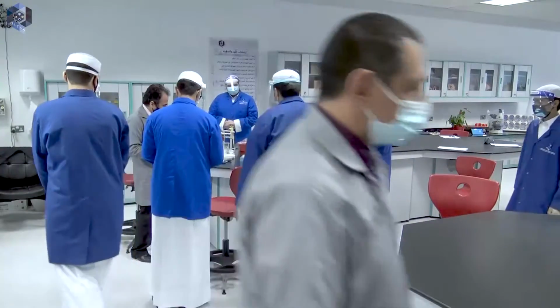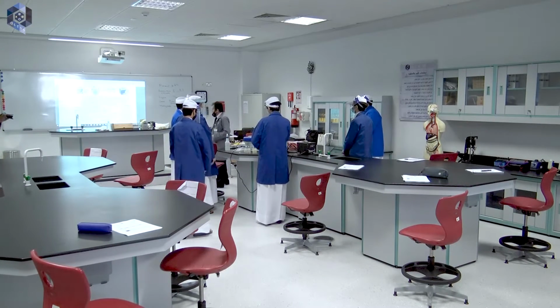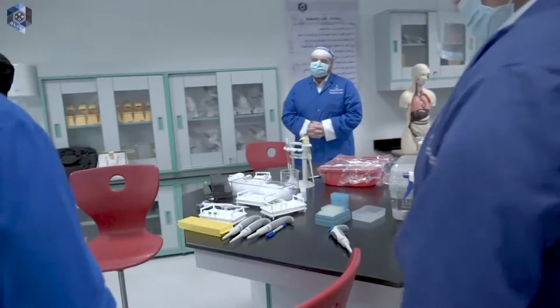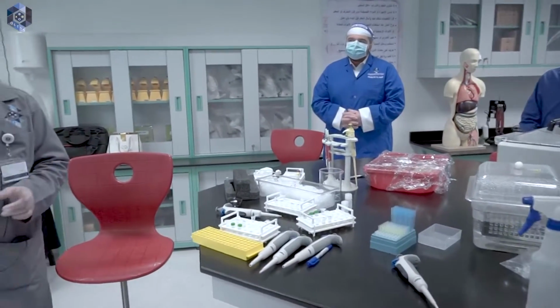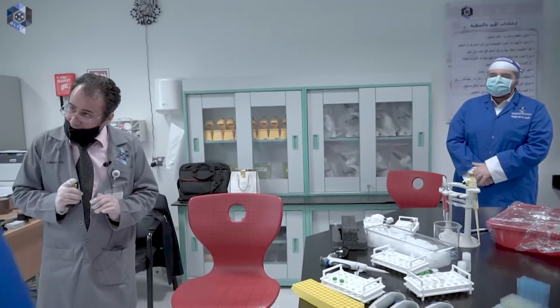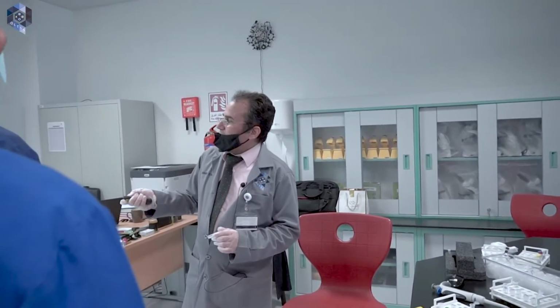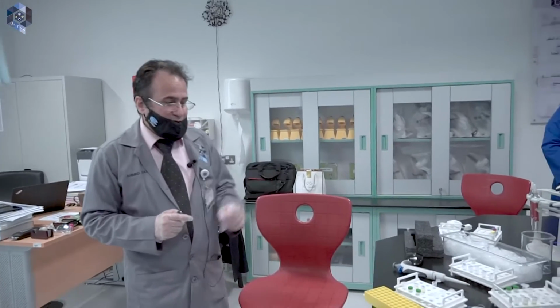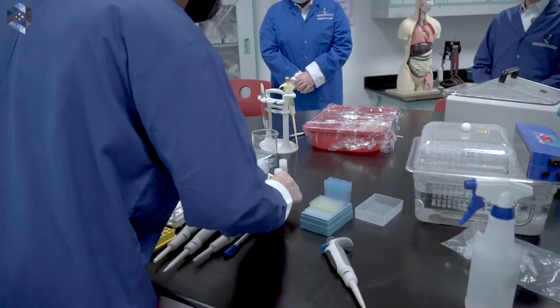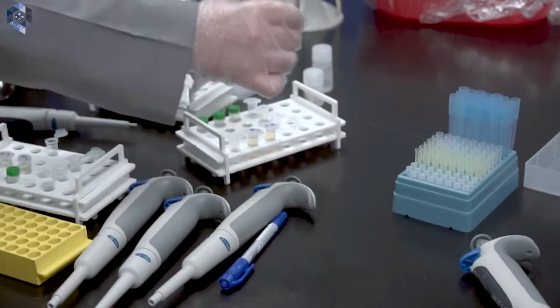So far, we have labeled the DLR tubes: dilution, ligation, reactions. Now we will start adding the components. We need 5 microliters of the DNA. Did we do this step? Nassar, do you remember? Did we add 5 microliters? We added 5. To which one did we add? Show me, please, because you did this step, right? To this one. Okay.